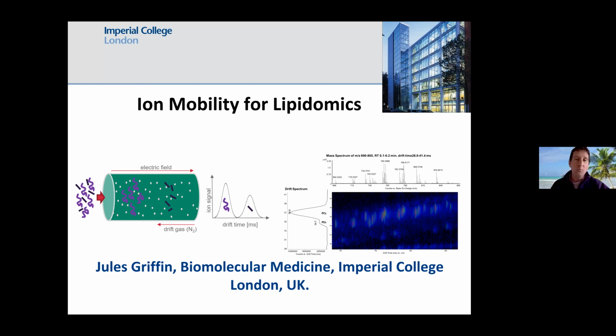So what I would encourage you to do is read around some of the reviews that I've listed as I've gone along. We've also heard about ion mobility in several talks already, so particularly have a look at those talks. Sven gave a very nice introduction to TIMS as a form of ion mobility. So I'd recommend that. There are a few caveats right at the start.